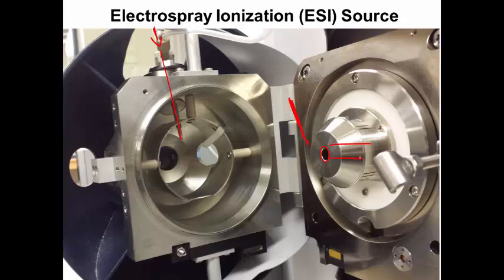Our sample is going to be sprayed as a solution, and as it exits this tip it's going to make this curved path going from one point to the other. This tip will be held at a very high positive potential to emit positive ions, and the process that's happening here is something called electrospray.